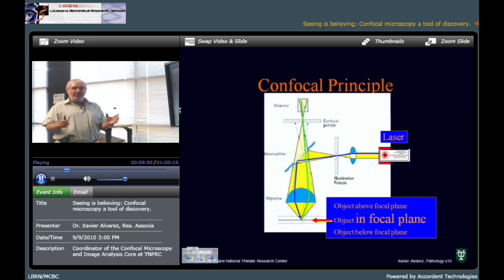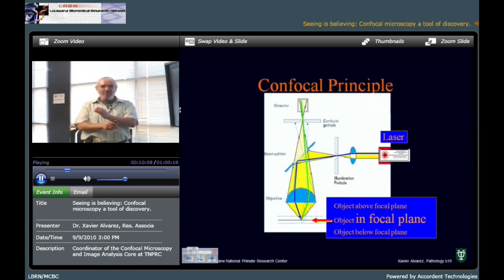Just imagine if light comes through the other side, the side of the paper, then there will be, in exactly the opposite direction at the exact distance, another point that will focus the light from here to there. I'm going to include that slide next time. Burning paper.